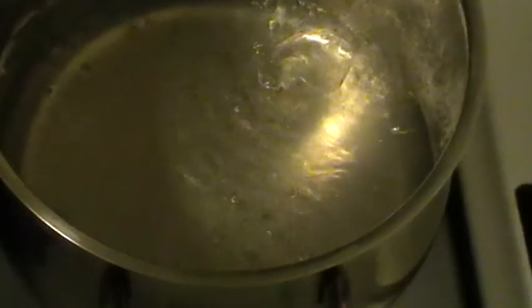We have here the salt solution. Bubbling still much slower than the water. There are bubbles, but it's still much slower than the water. Reminder, it's been about 4 minutes and about 30 seconds around now. We'll leave it for another minute or so to see what happens.